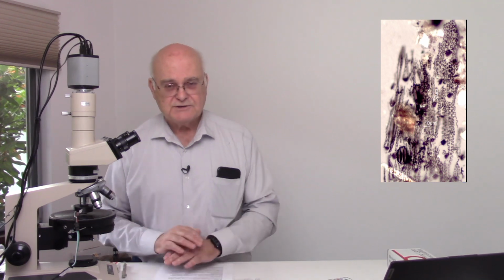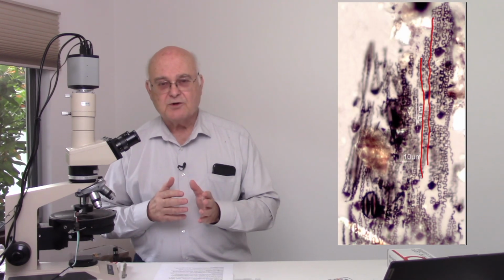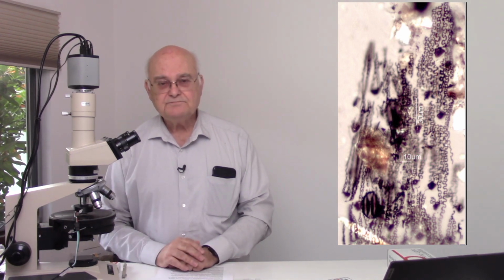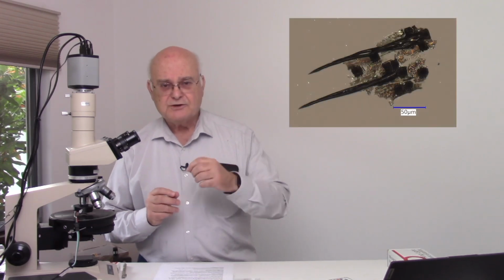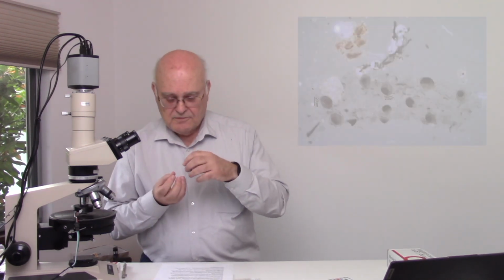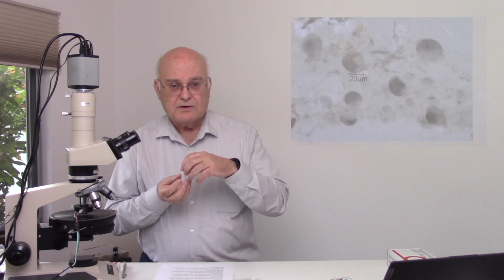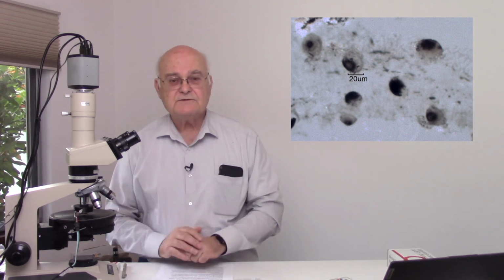Now, leaf structure, if we're looking at a grass, for instance, that's charred: we're going to see a linear structure in the cells. We're going to see stomata, the breathing apparatus for the leaves. We're going to see the trichomes, the hairs on the surface of the leaf. We're going to see the little circular silica phytoliths that may be black in appearance because of deposited carbon, that are the base of the fibers on these leaves.